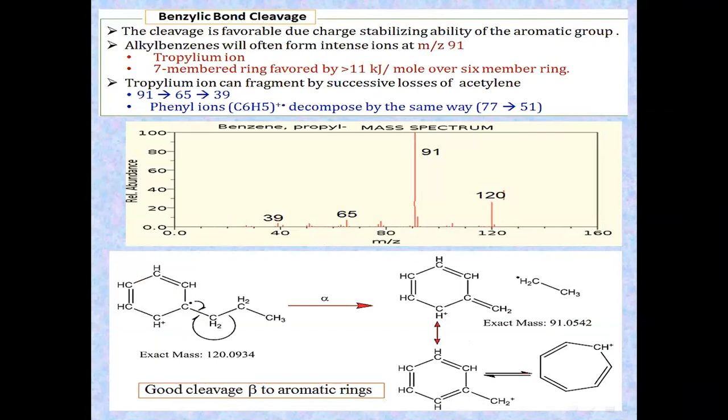Another type, we are going to have it as the tropylium ion. The tropylium ion gives me very stable fragments, giving a sharp, high, intense peak, which in most cases is considered the base peak if a benzene ring is bonded to a carbon. In other words, if I have a benzylic position in my compound. First of all, I am going to have a benzylic carbocation, and then expansion of the ring in order to form a 7-member ring, which I name the tropylium ion.